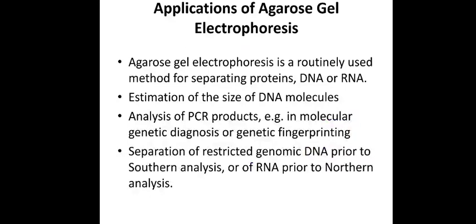reference sheets, like if you want to compare the child and the parent, or if you are trying to identify the culprit, you have a sample, then you take DNA from the culprit and run both of them simultaneously, get a sheet. In that you can compare the DNA fragments, because in one more chapter we might be discussing the DNA fingerprinting technology, where we'll come across this VNTR and all.